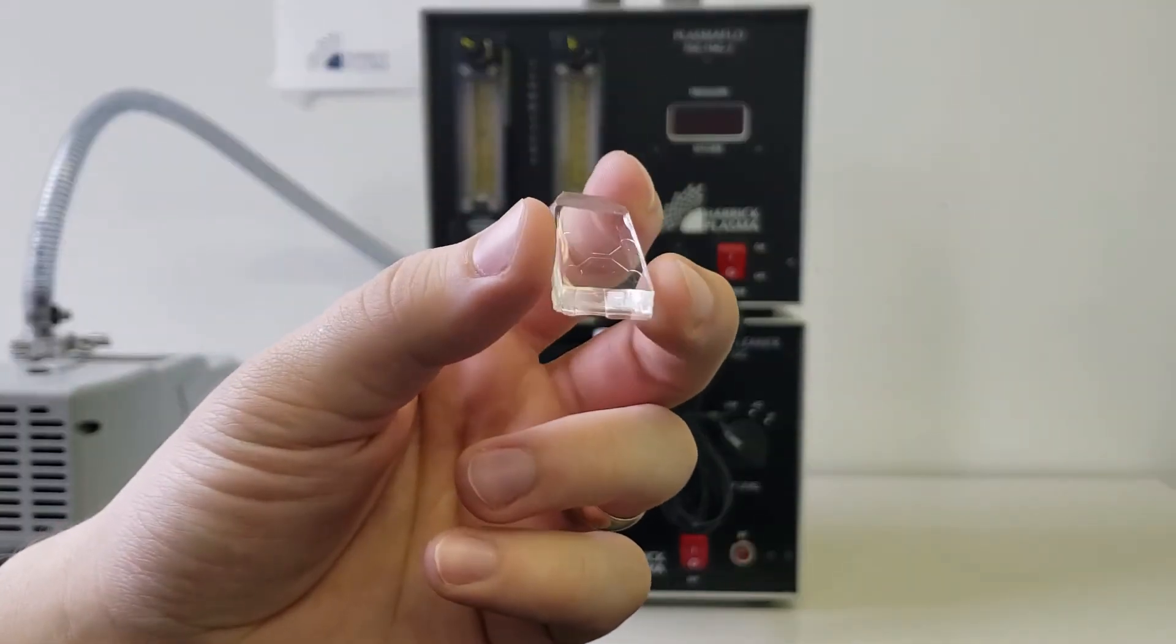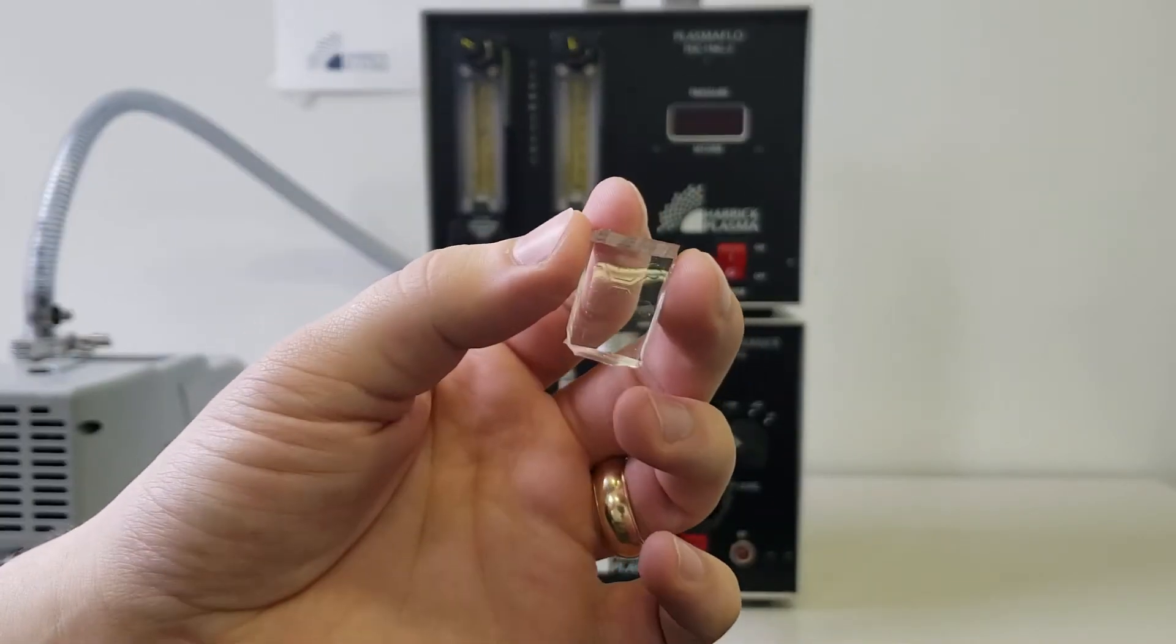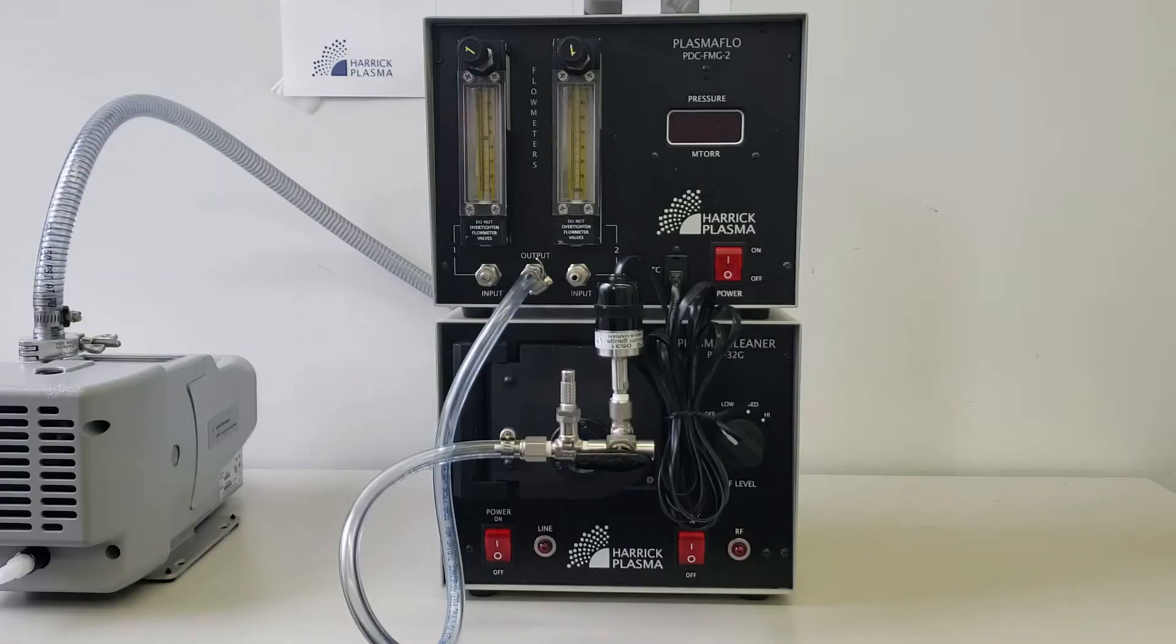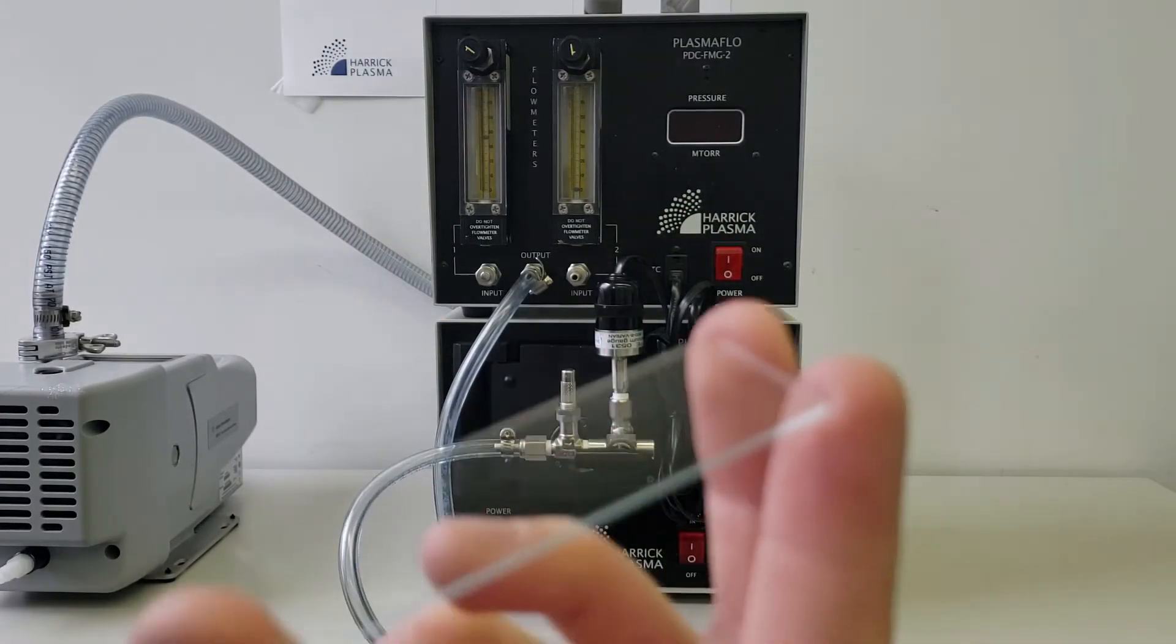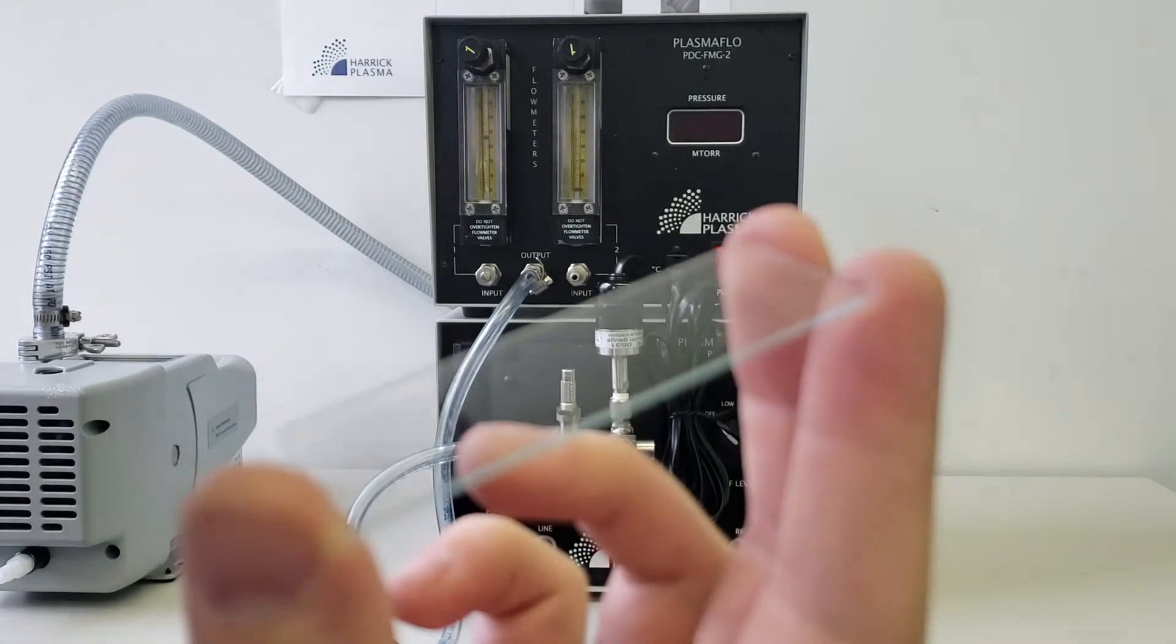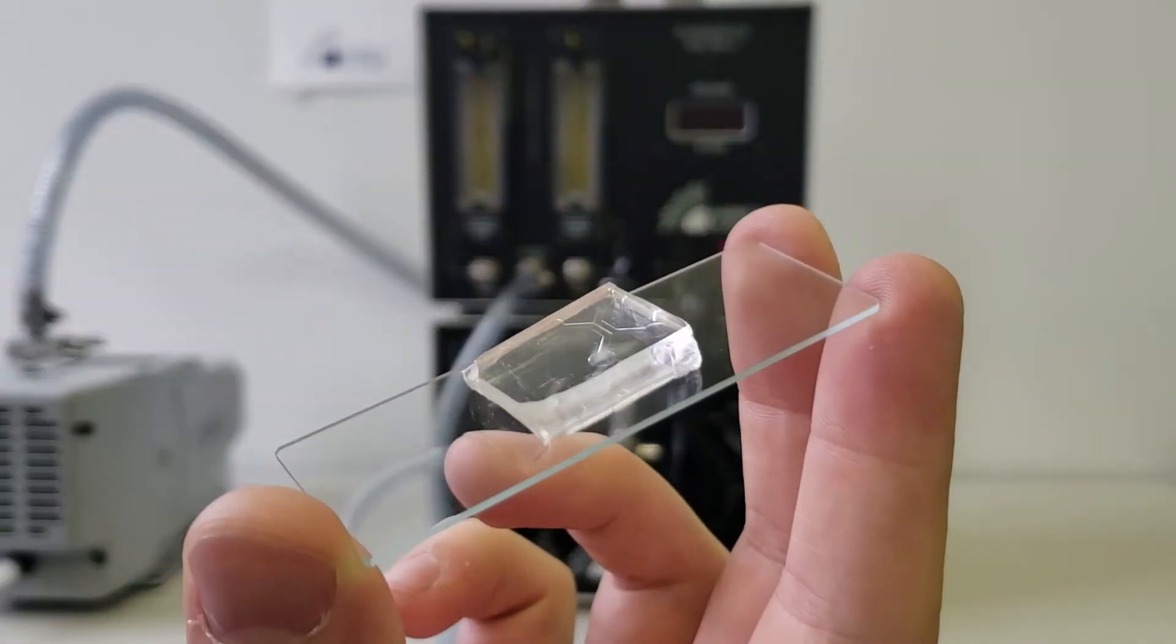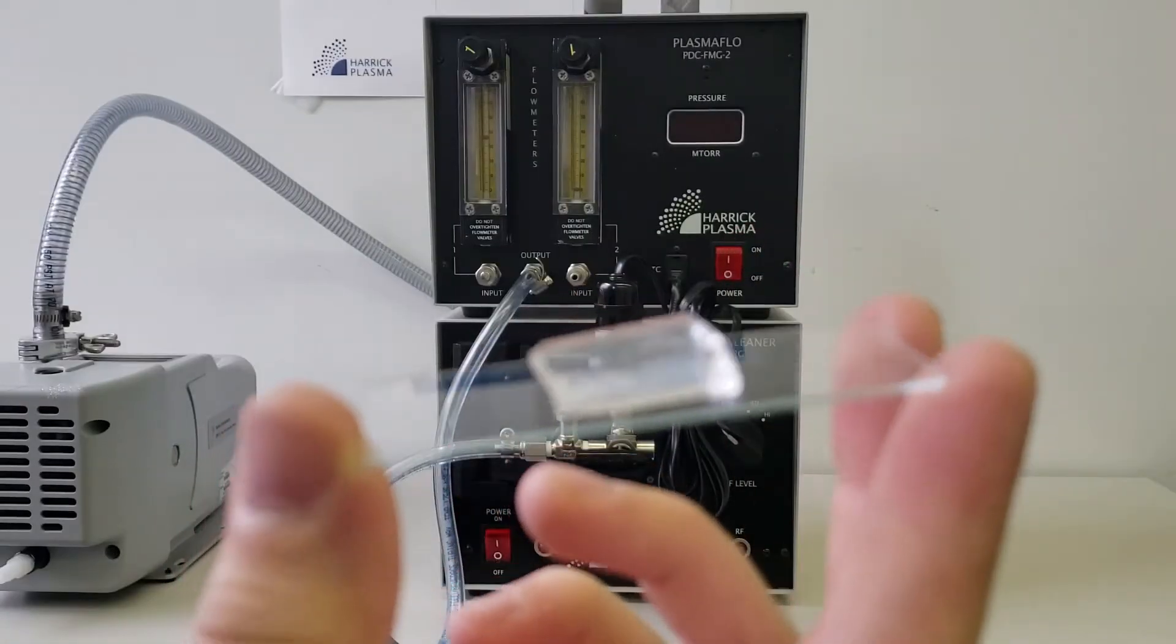To begin, you will need a PDMS microfluidic device and a glass slide. The goal of plasma treatment is to form watertight covalent bonds between the PDMS microfluidic device and the glass slide.